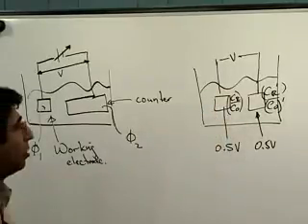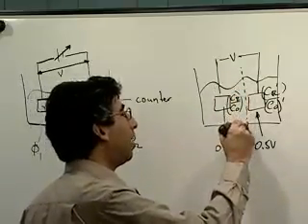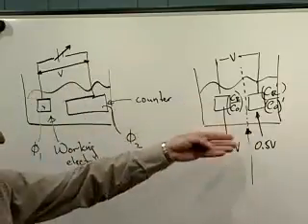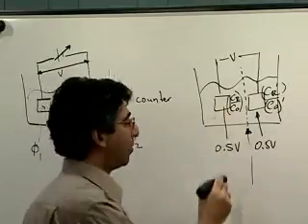Now, actually, when you typically do that, if you want to synthesize something, let me point out that you need to put a barrier in there, or else whatever you oxidize at one electrode is going to be reduced at the other electrode, so you're not going to get very far. So we need to have a separator.